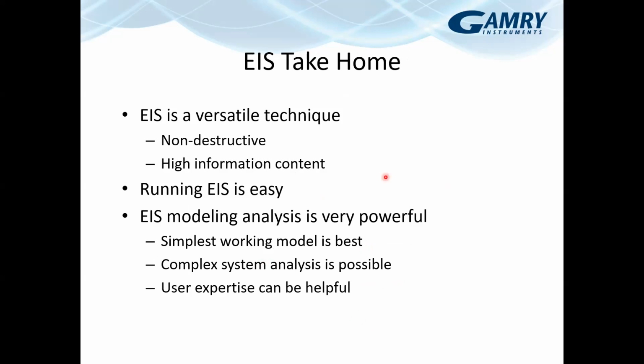EIS is a versatile technique. It's non-destructive, it's high information content. Running EIS is very easy. Sometimes it's too easy because it gives a false sense of security about the quality of the data that you're getting back.